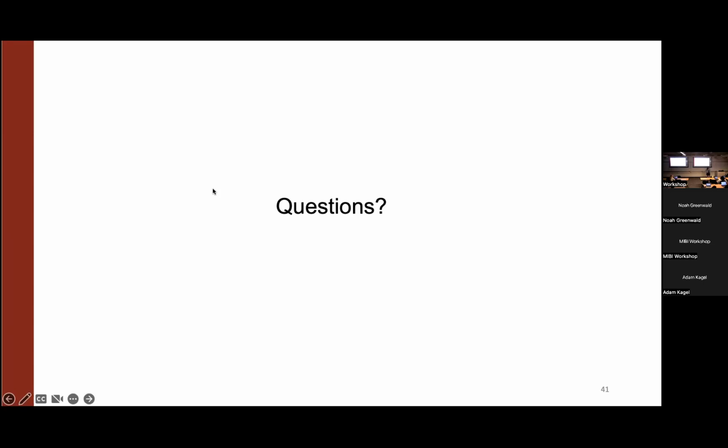Yes. Another way to put it is, if you want to start a fight at a computational biology meeting, just ask people how they choose the number of clusters. That's all you need to do. So I guess what Candace and Mike are saying is that you're better off being more granular and then using your expert knowledge, or at least interest, to drive how the last few grouping steps are done. And this is not specific to MIBI or even spatial biology. Anyone doing single cell workflows will tell you this. Your rare, potentially interesting cell populations will always get sucked into another cluster if you try to automatically get to the right answer without any kind of interventional steps along the way.